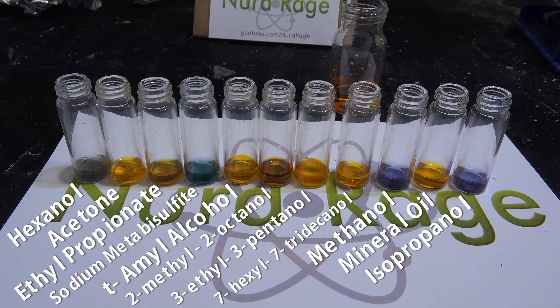This test is cheap and easy to perform without any specialized equipment, but its usefulness is very limited by itself. All it does is tell you if something can be oxidized by acidic dichromate — it does not tell you very much about what that substance actually is. Ketones, esters, tertiary alcohols, and mineral oil all give negative results, while primary and secondary alcohols as well as sodium metabisulfite all give positive results. This test alone can't tell the difference within those groups.